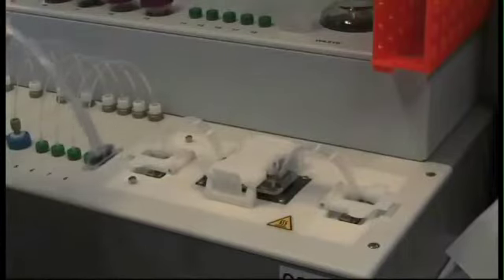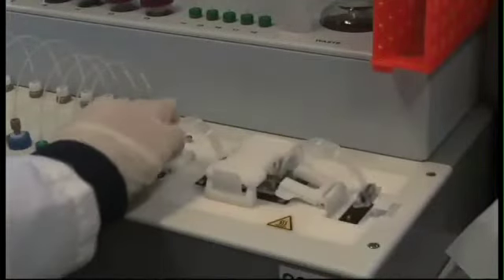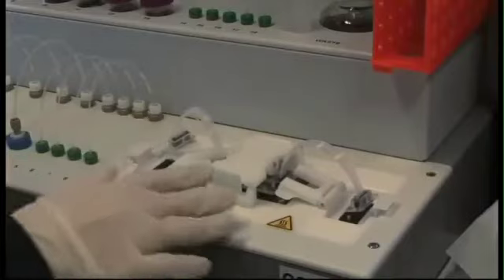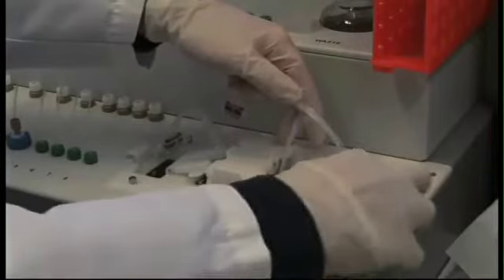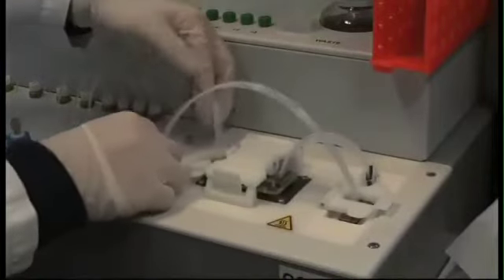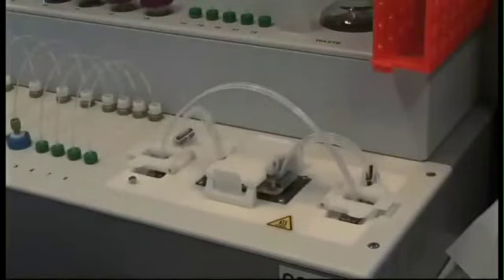If you notice improper, poor, uneven, or slow flow on the cluster station, it might be due to small clogs in the lines. A simple solution is to try to flush the clogs away using the bridge manifold. You can set it up to bypass the Flowcell without having to remove the Flowcell from the cluster station. After pausing the recipe, unhook the two ends of the amplification manifold, but keep the Flowcell clipped into its environment, undisturbed. Attach the wash bridge.